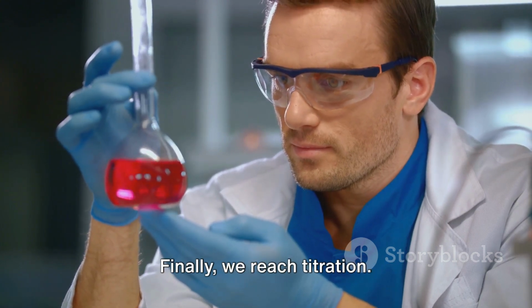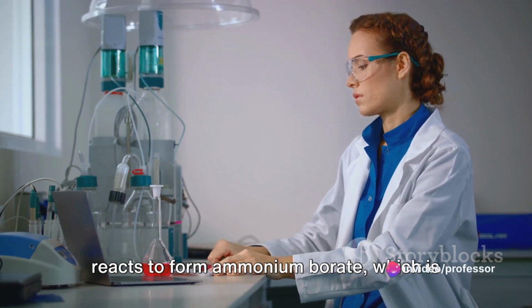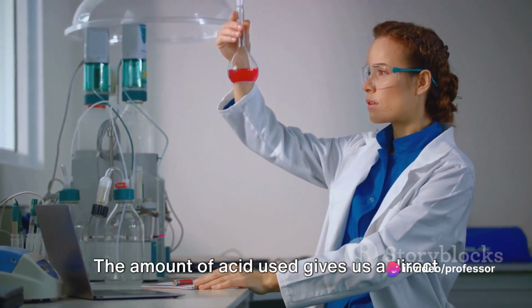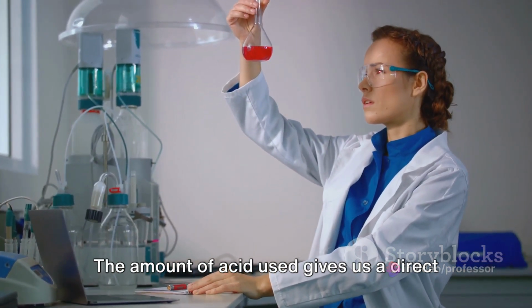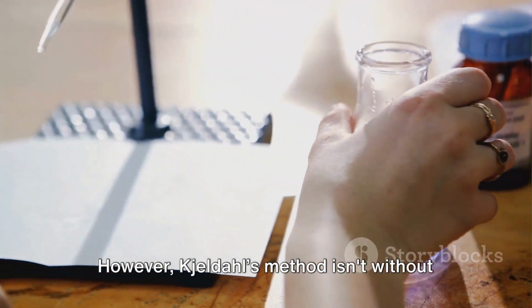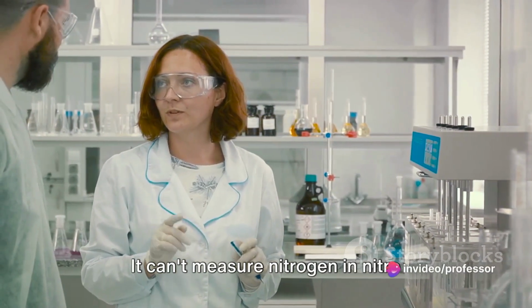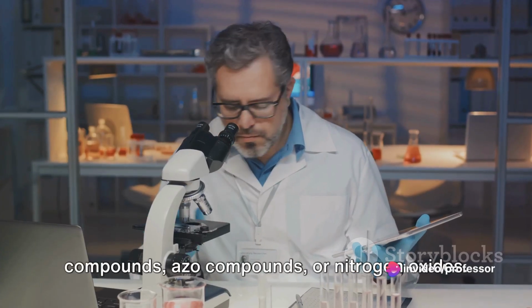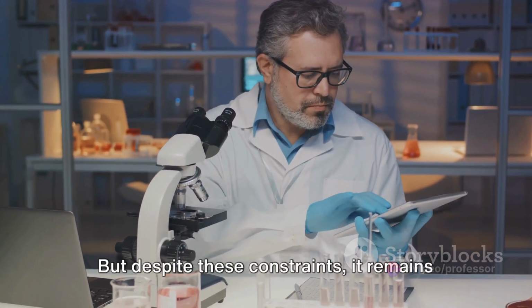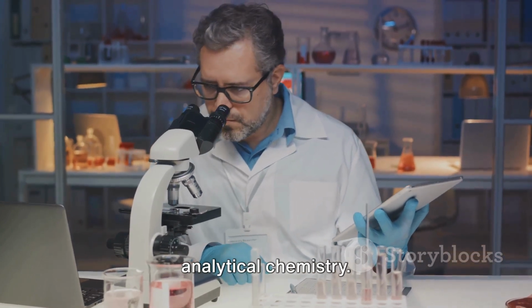Finally, we reach titration. The ammonia in the boric acid solution reacts to form ammonium borate, which is then titrated with a standard acid. The amount of acid used gives us a direct measure of the nitrogen content in our original sample. However, Kjeldahl's method isn't without its limitations. It can't measure nitrogen in nitro compounds, azo compounds, or nitrogen oxides. But despite these constraints, it remains a widely used and dependable method in analytical chemistry.